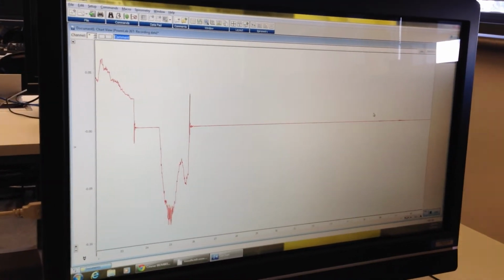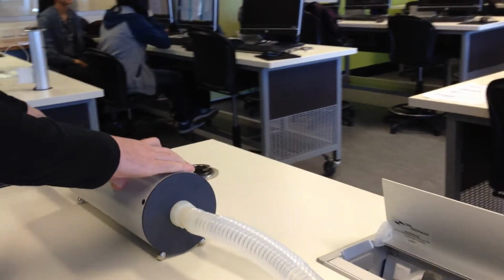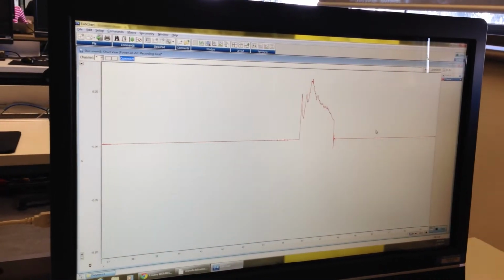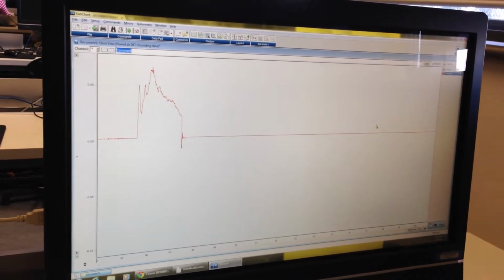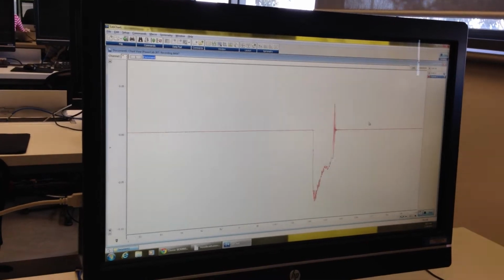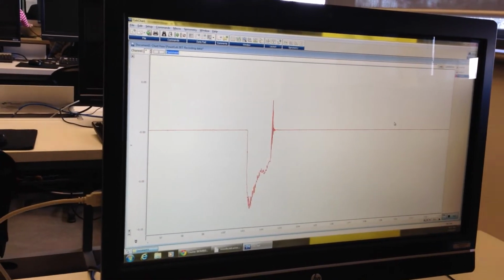So the first part of the experiment is going to be to calibrate the sensors. You will go through a procedure of pushing the syringe in, and then you'll get a flow waveform. If you integrate the area under that waveform, there should be 3 litres of volume which has flowed in that time. And then you extract it back out again, you get another waveform. So you'll do that maybe 10 times, so perhaps 5 repeats of one in, one out, that's 2, and in and out again, that's 4, and so on until we do 10.